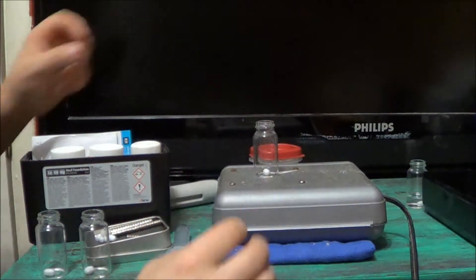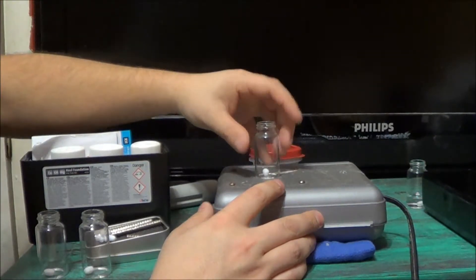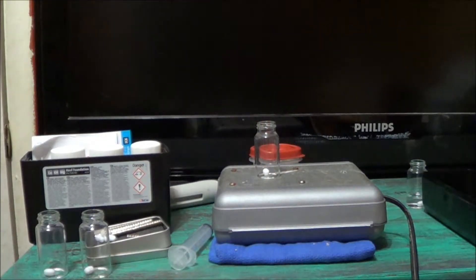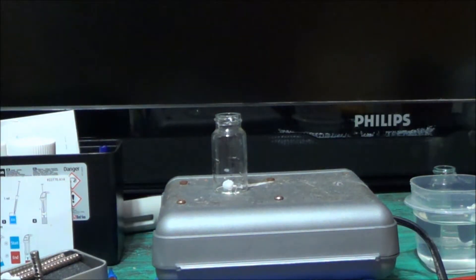We're going to center it up on top of the magnetic stirrer. All right, so our first test is actually going to be alkalinity.